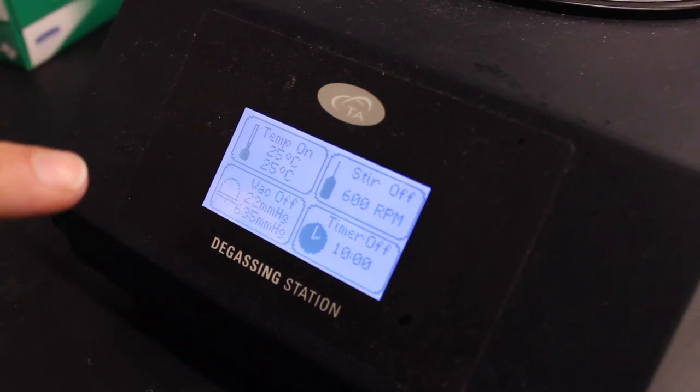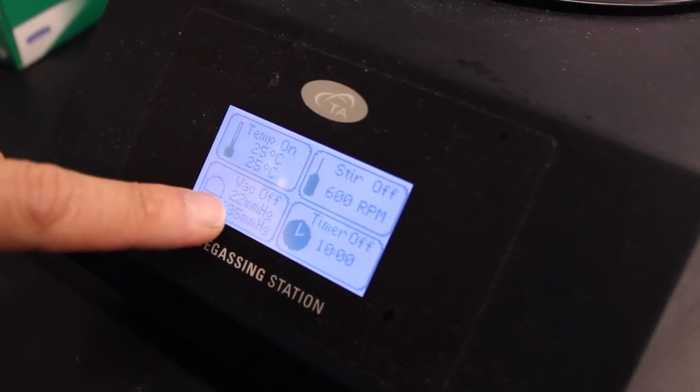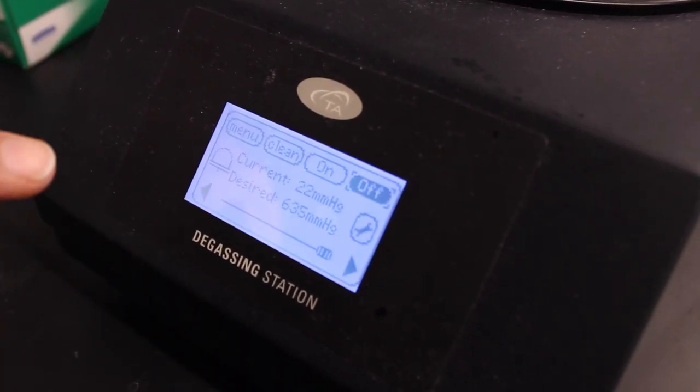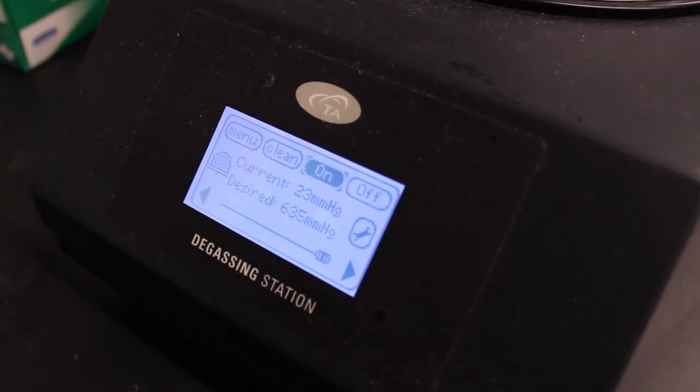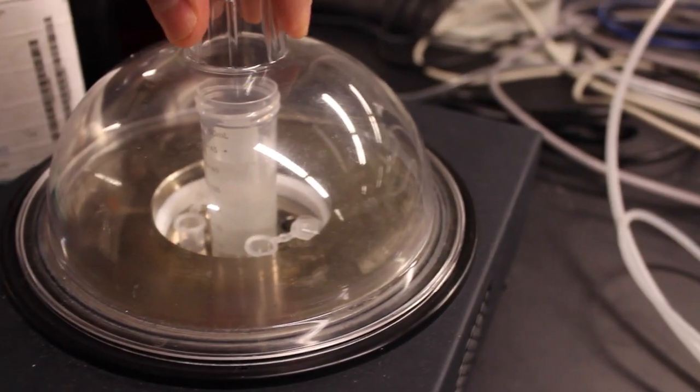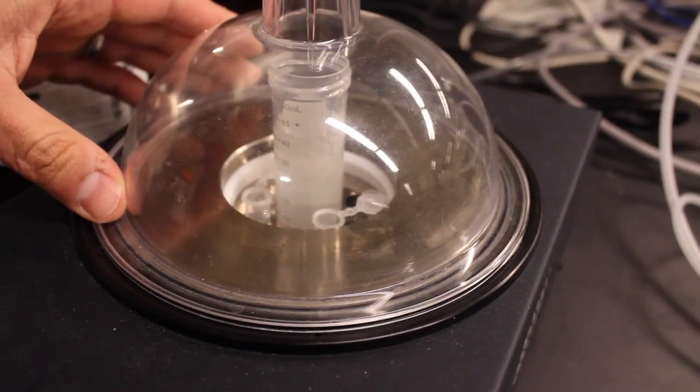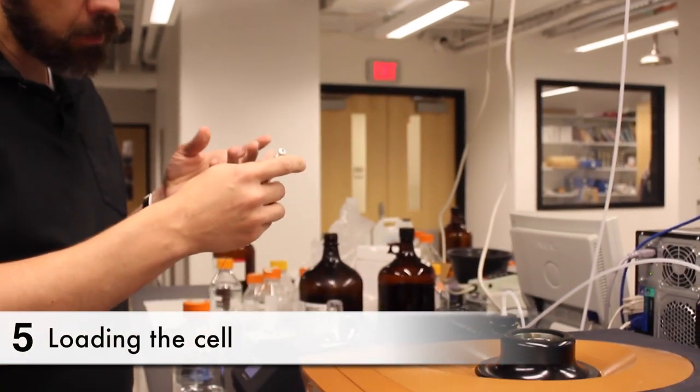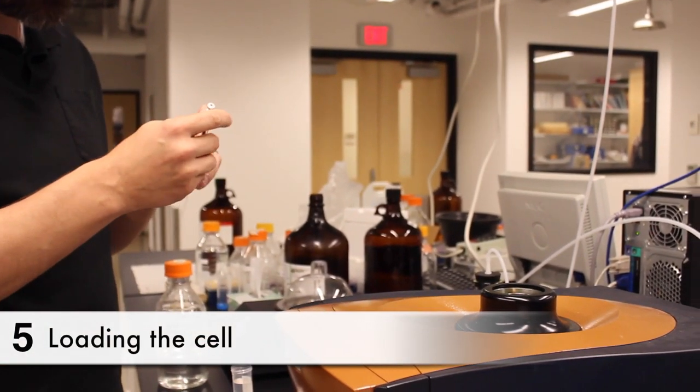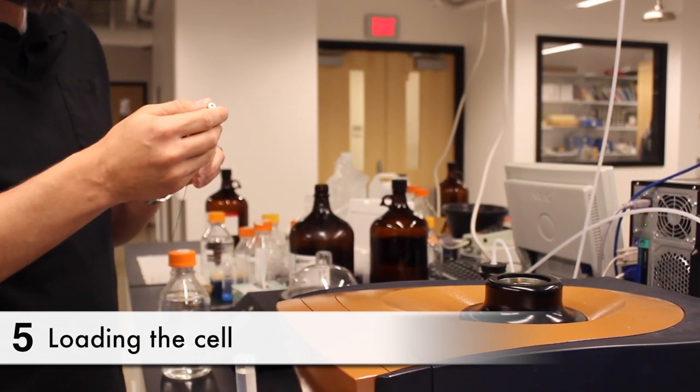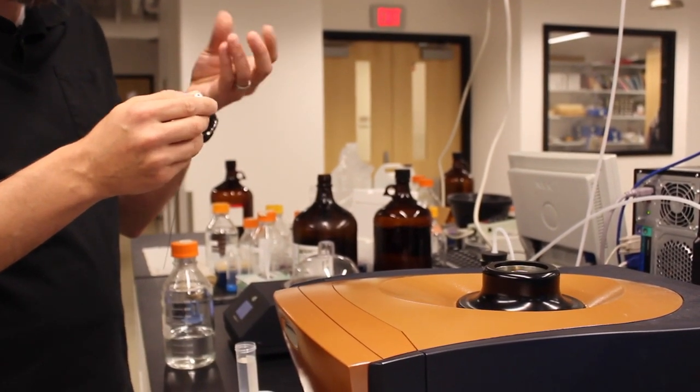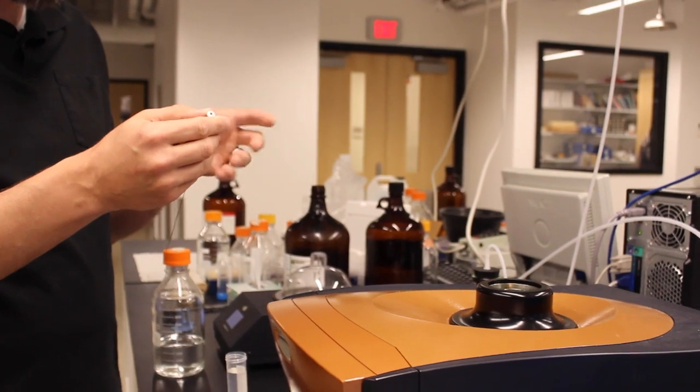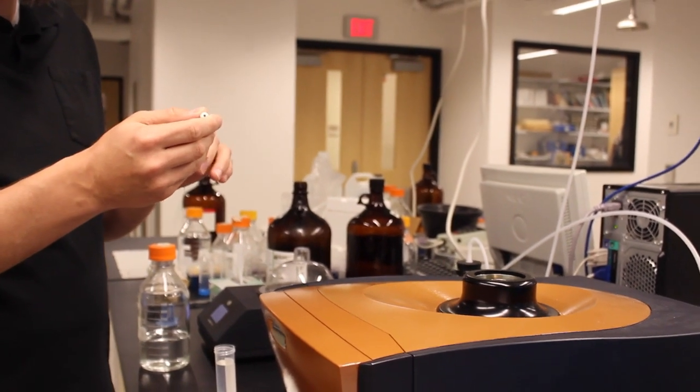To degas, what you want to do is to turn on the vacuum. That will start pulling a vacuum under this little bell jar here and now I'm going to load it with the liquid to put in the cell. As I said, normally it would be a buffer with your macromolecule in it. In this case it's just going to be water.